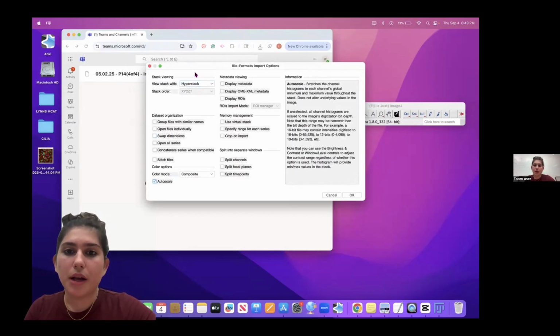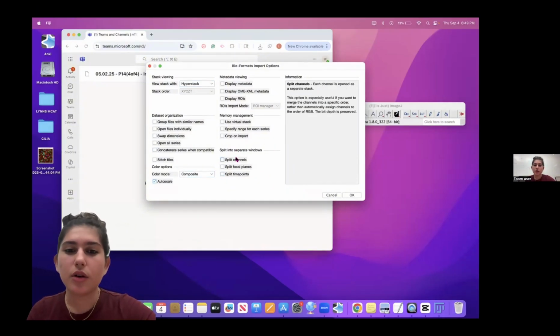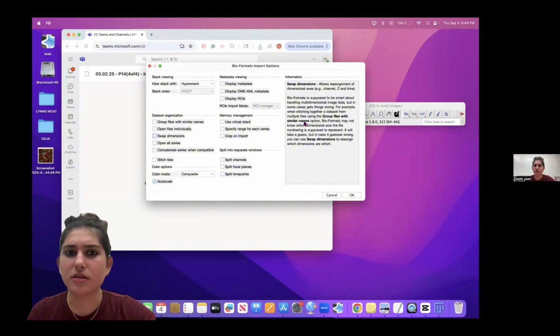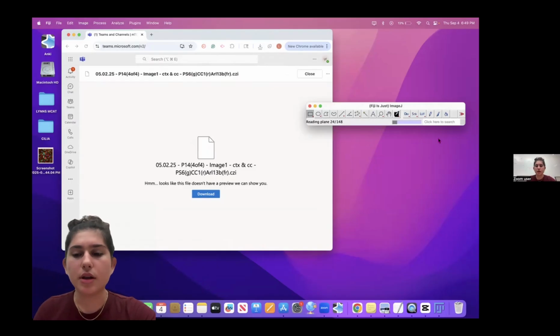This is what my options look like. Now, yours might be different. You might want to change it to mine, but once you later understand what all of these mean, you'll be able to customize them to yourself. This is just what's been working for me so far. To make this easier on you, I would copy this. And that's loading.